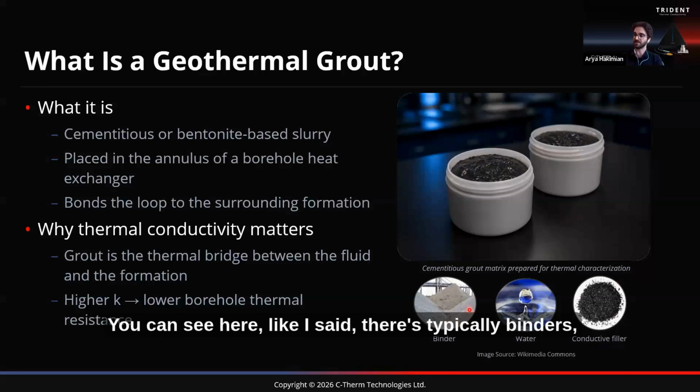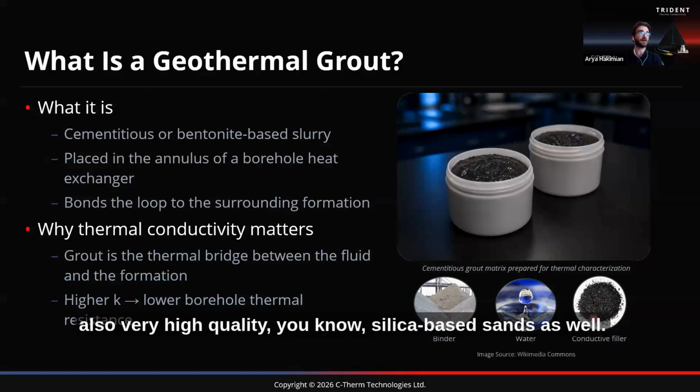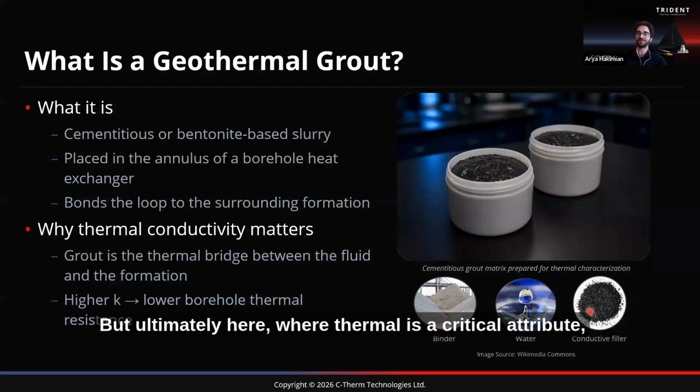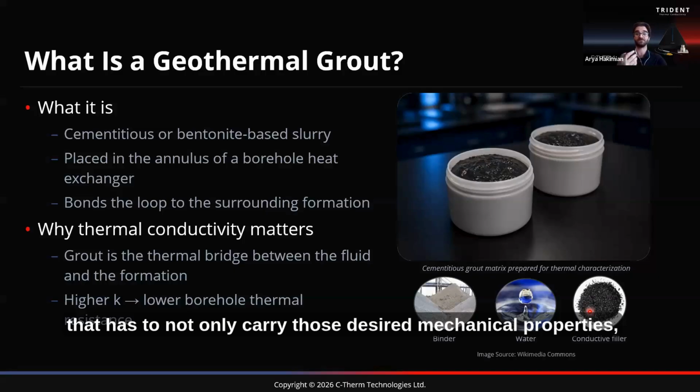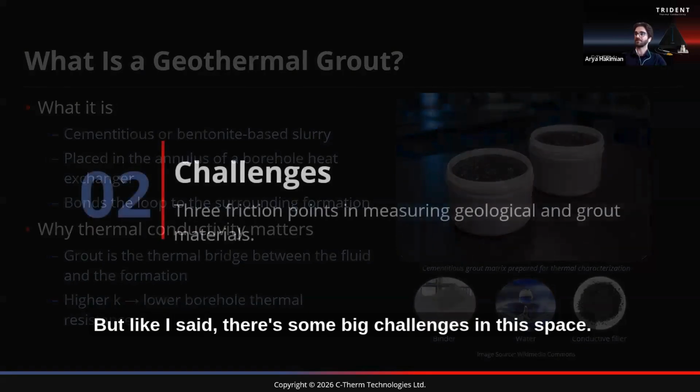You can see here there's typically binders, additives, and conductive fillers that could be graphite based, also very high quality silica-based sands as well. There's a variety of different formulations and chemistries that can be investigated, but ultimately, where thermal is a critical attribute, it has to carry the desired mechanical properties as well as the thermal aspects. So, a little bit of background there.